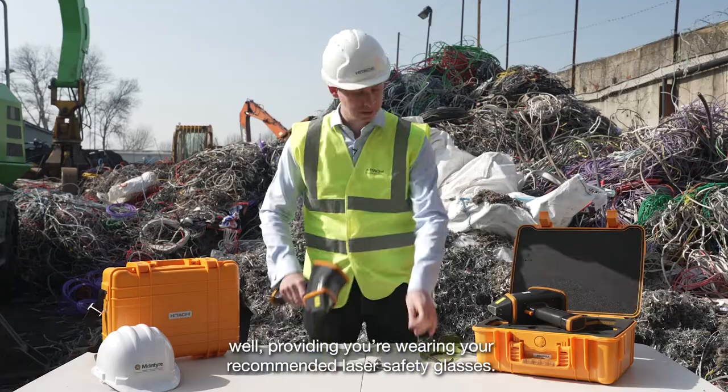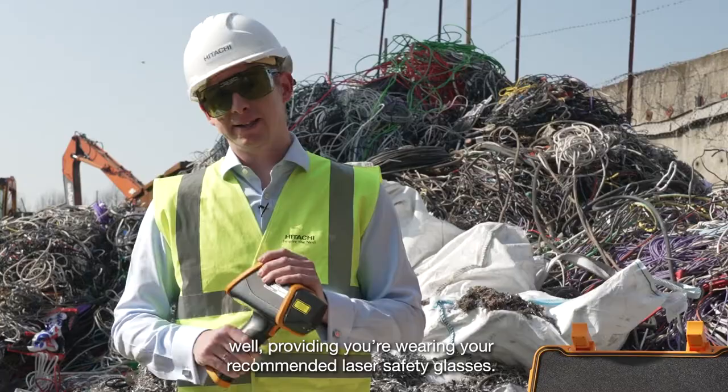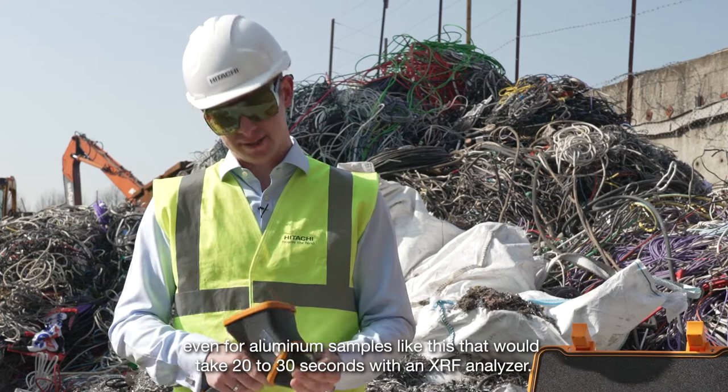Providing you're wearing your recommended laser safety glasses. Delivering full chemistry and grade analysis from our comprehensive grade library in just one second — even for aluminium samples like this that would take 20 to 30 seconds with an XRF analyzer.